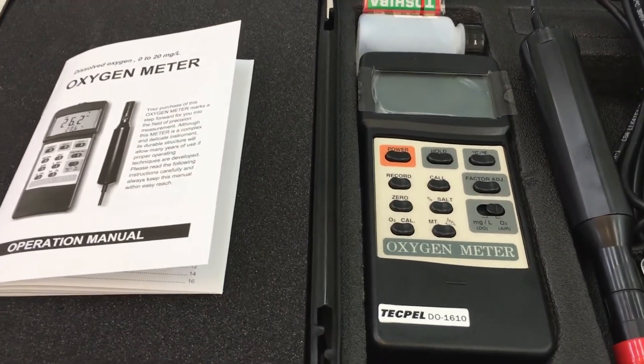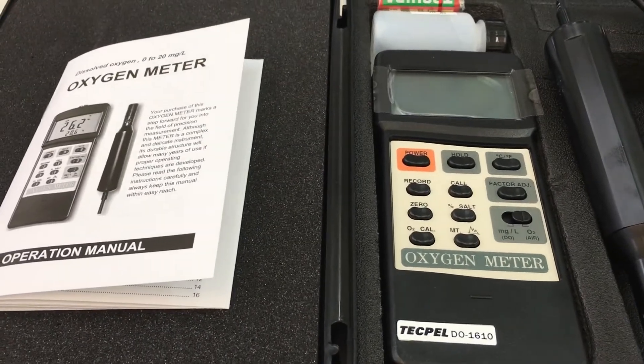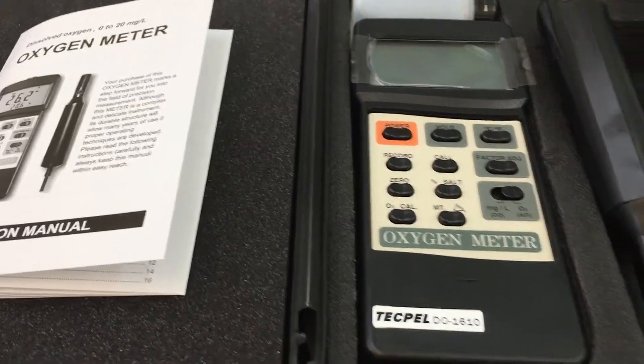Hi, let me introduce you to oxygen meters — dissolved oxygen meters — the TECPEL DO-1610.